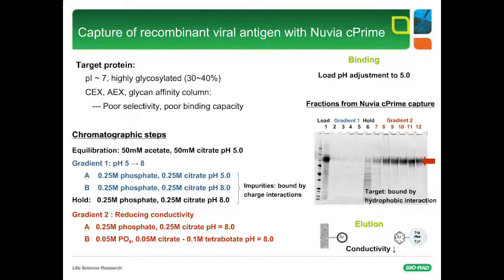Okay, I understand. So perhaps there may be a way to reduce the salt, pop the pH to create a more drastic set of conditions where the target protein could just come right off. So we need to identify the main interaction. The main interaction, okay. And disrupt that.